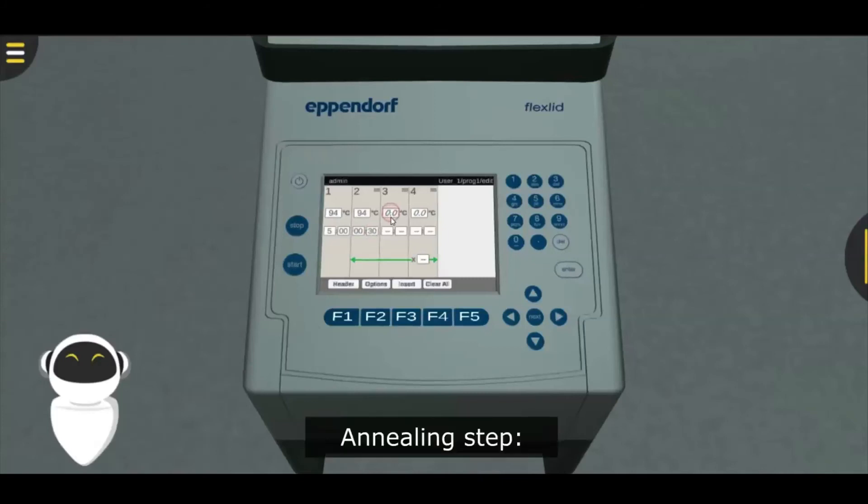Annealing step at 50 to 65 degrees Celsius for 30 seconds, 30 cycles. Elongation step at 72 degrees Celsius for 1 minute, 30 cycles.